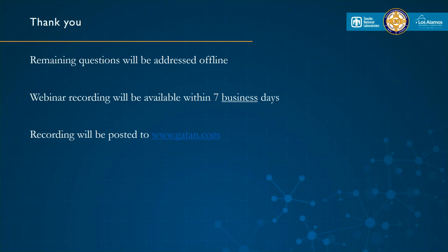So how do you evaluate the critical electron dose before you're getting beam damage in your material? How do you determine that? The critical total electron dose, I guess, or maybe they're referring to the critical dose rate. I'm not sure.